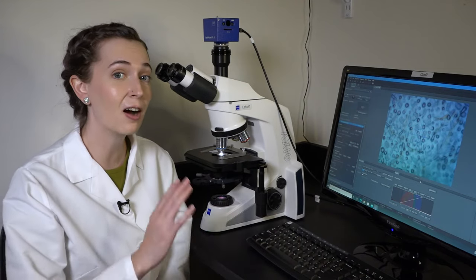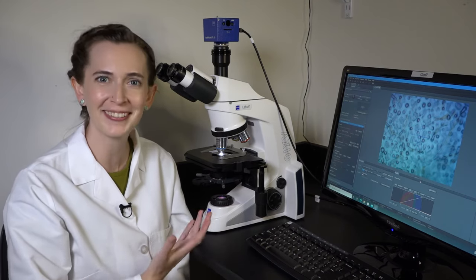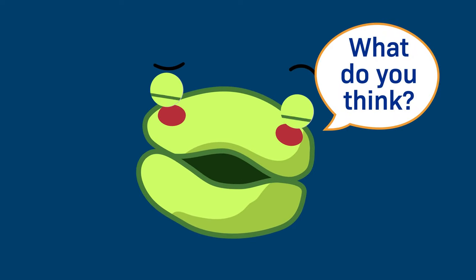Okay, so this is the underside of the leaf. There are a lot of stomata there. They're pretty dense. Let's look at the upper surface of the leaf next. How many stomata do you think we'll find there in comparison?